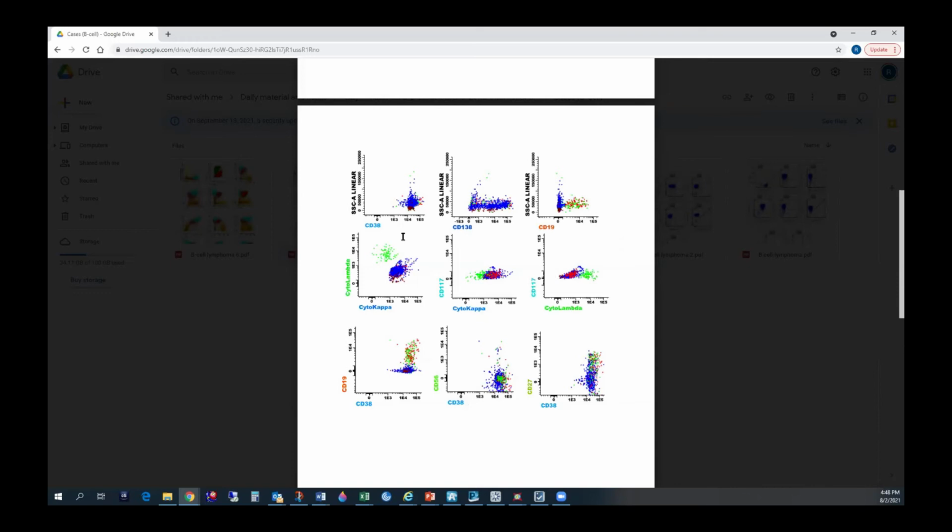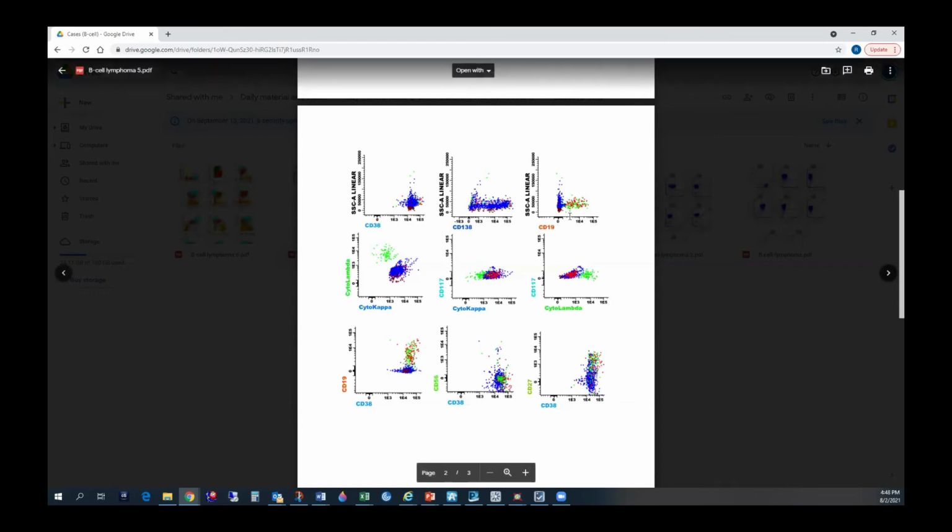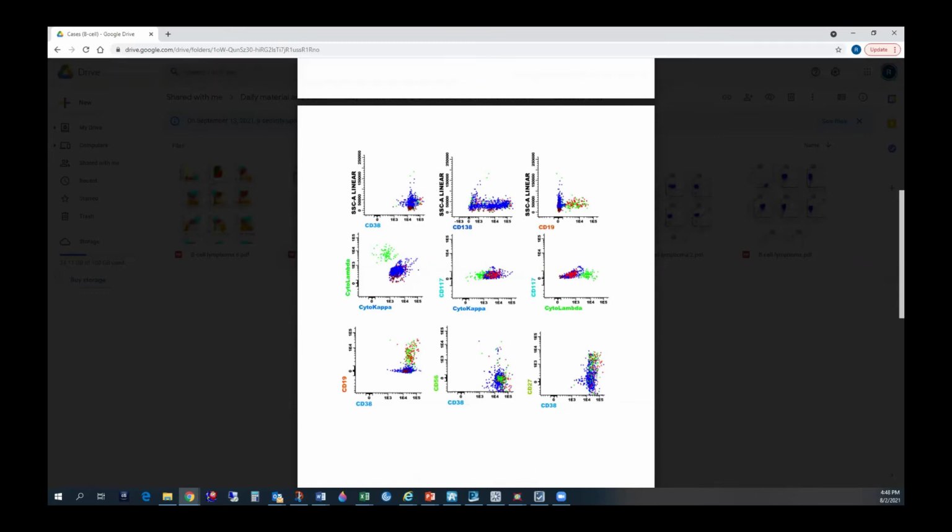Okay, so these are all plasma cells. Normal plasma cells will have CD19, and neoplastic plasma cells will lose CD19. So that's what they did here. They did a CD19 subgate. They took this population and saw how the 19 expression is, and they saw a mixture of cells, green and red, and there are cells that do not have 19, so they just colored that population blue, right?